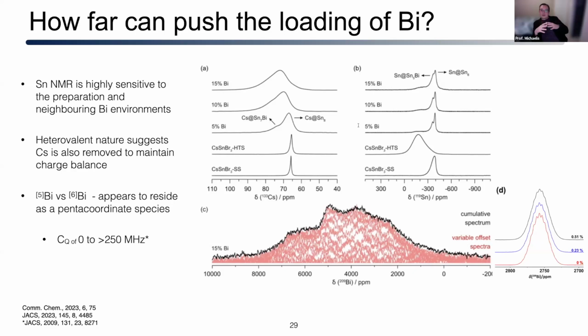Okay. When you start doing the mixtures of these solid solutions, depending on what you're seeing, for the lead example I showed earlier, you'd have to spin over 200 kilohertz to actually do MAS spectra. So those are actually done under non-spinning conditions, and that's the only way you can really approach that, including the XE data. The XE data are actually done under non-spinning conditions. So I hope that kind of answers that question.